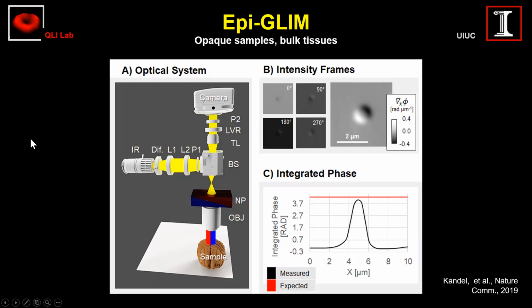And then we got a little bit more ambitious. How can I apply this to basically look at an in vivo piece of tissue, right? An animal or my skin, let's say, for melanoma, that's kind of an important problem. Since we have this great resolution and a way to increase contrast to remove this multiple scattering, we thought, how about we fold it and make it into a reflection instrument? So once you do that, then you are able to image bulk tissue. So I can look at my hand from this side. I don't need to go through this entire thickness of tissue. So actually, we managed to do that.